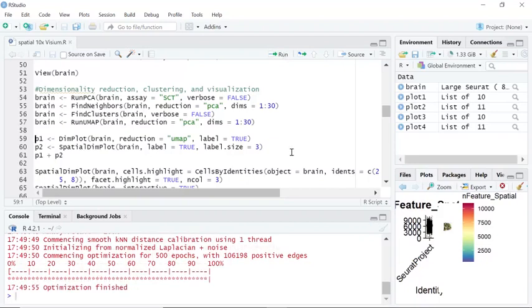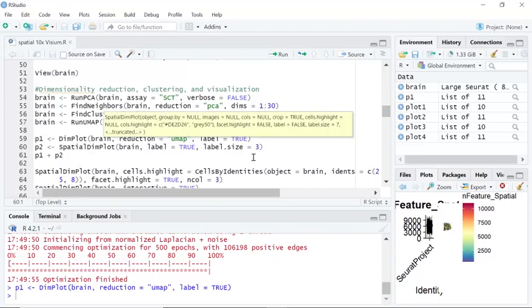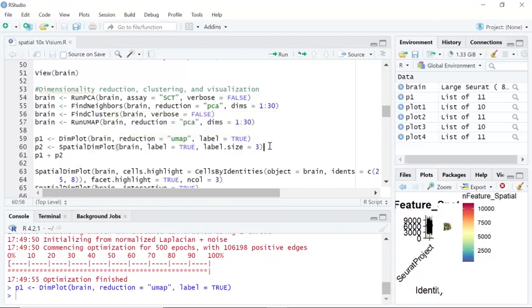Now we can visualize the clusters by the DimPlot function. We also developed a method called SpatialDimPlot to visualize the position of each spot on the image.